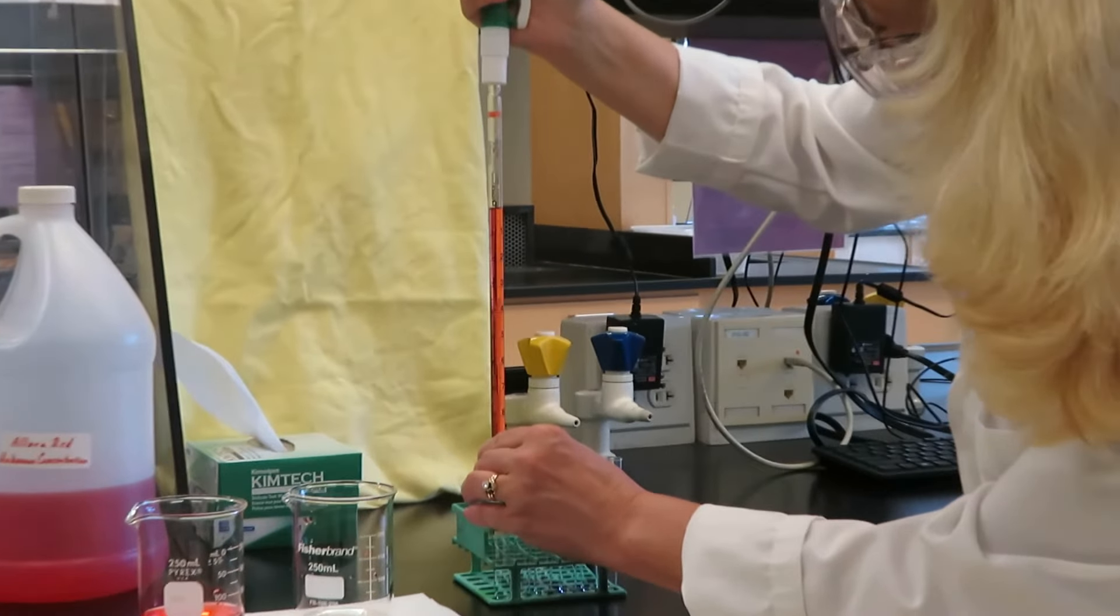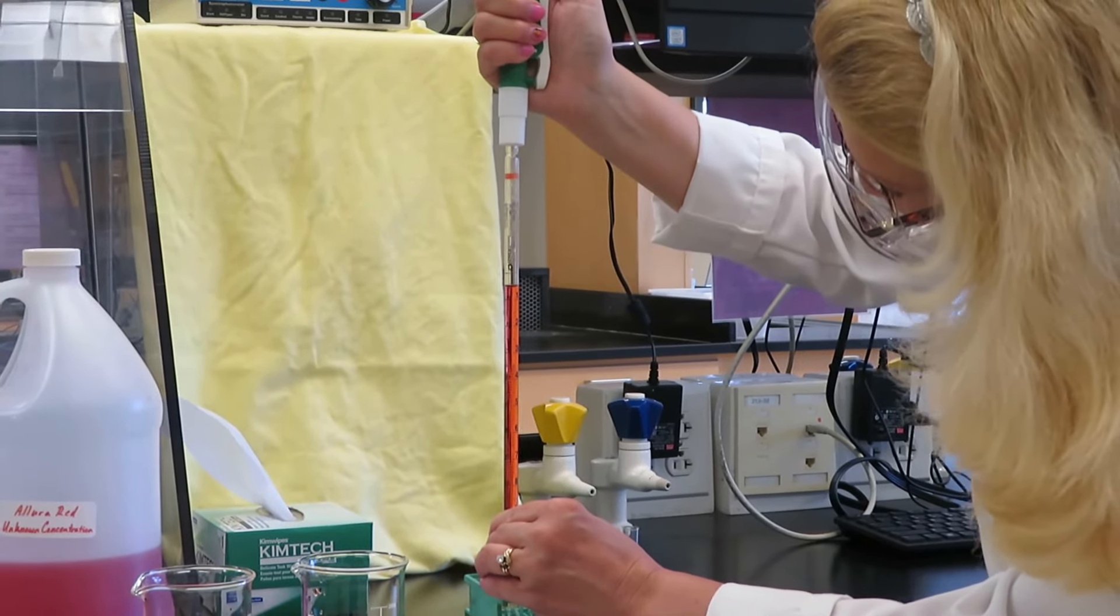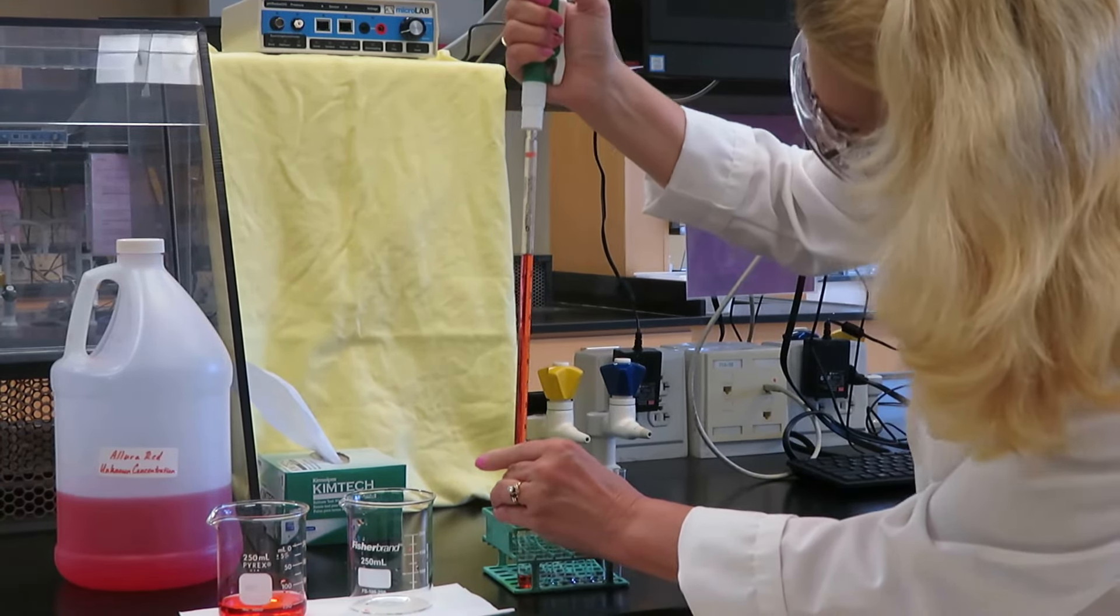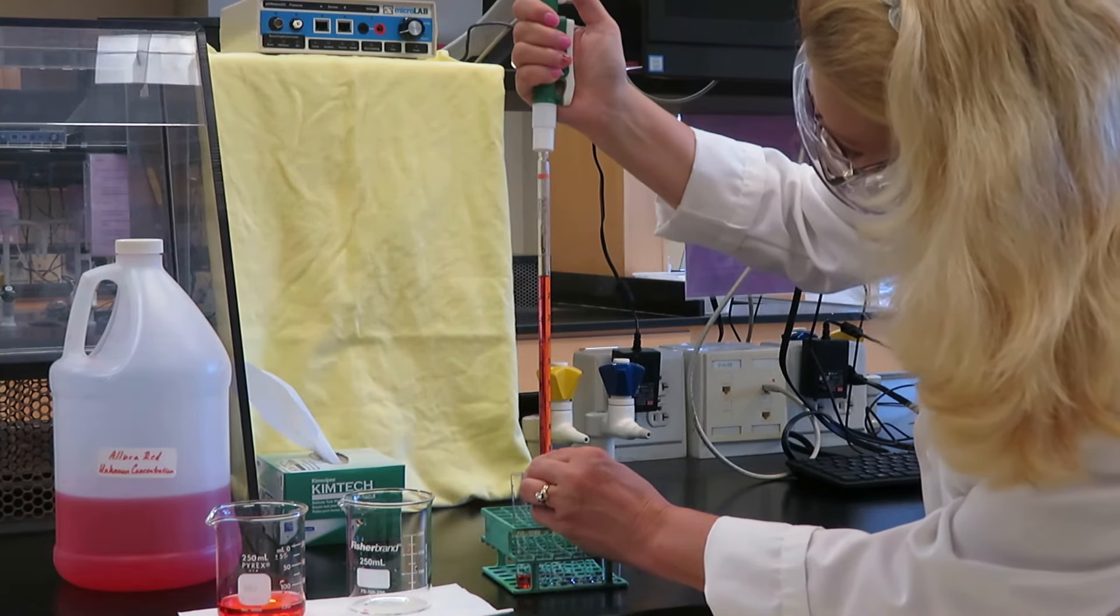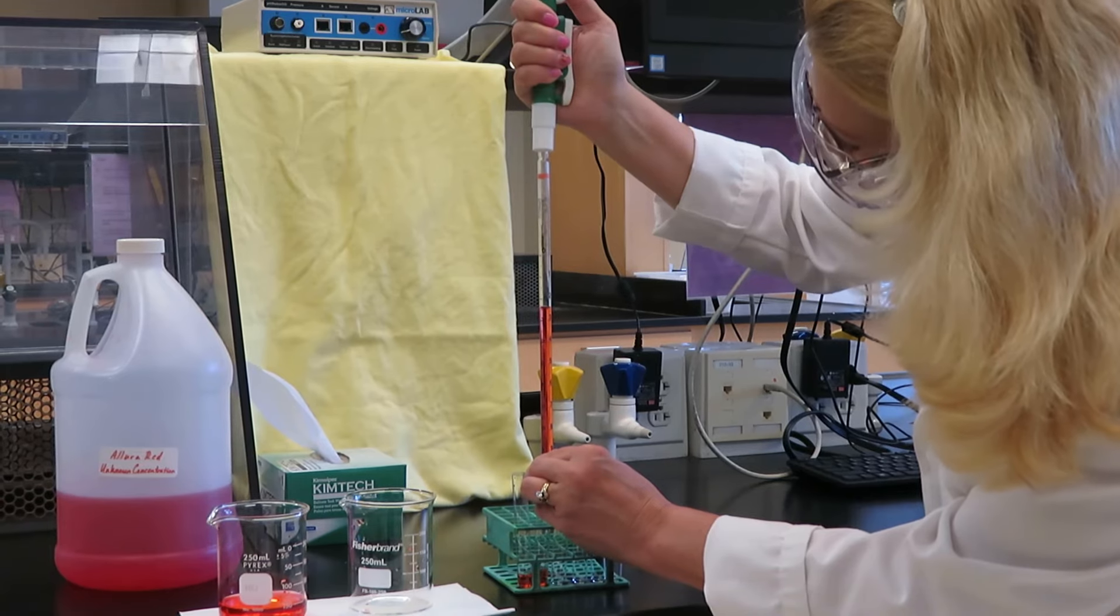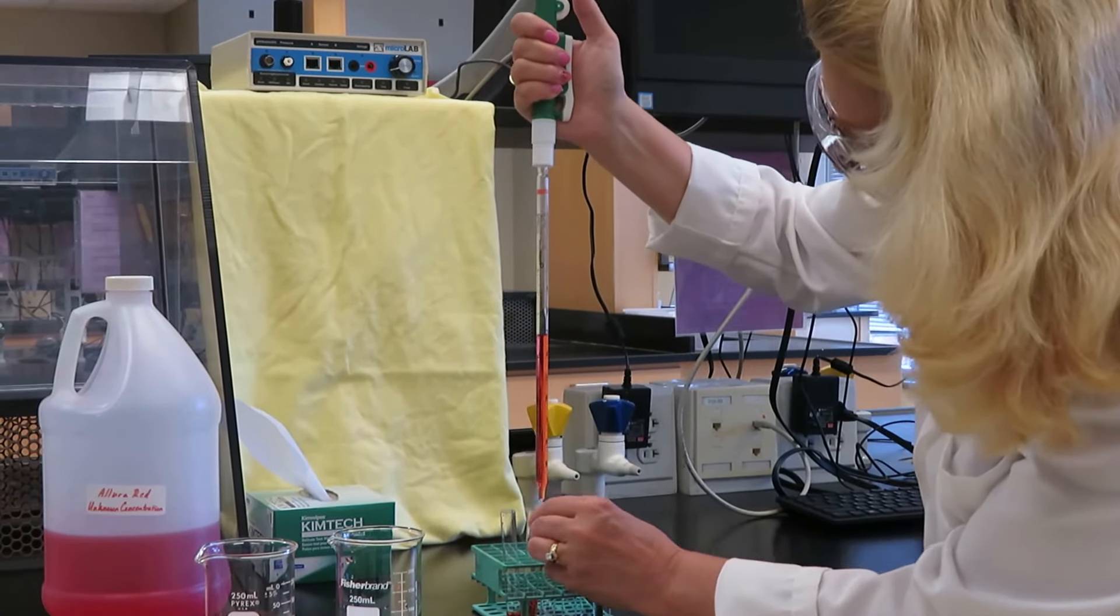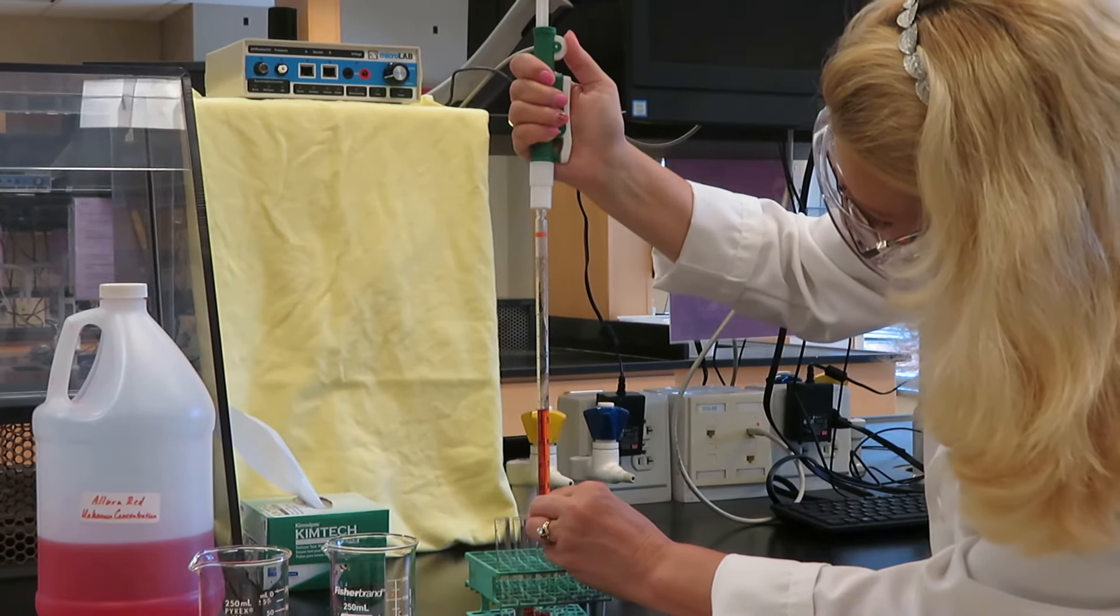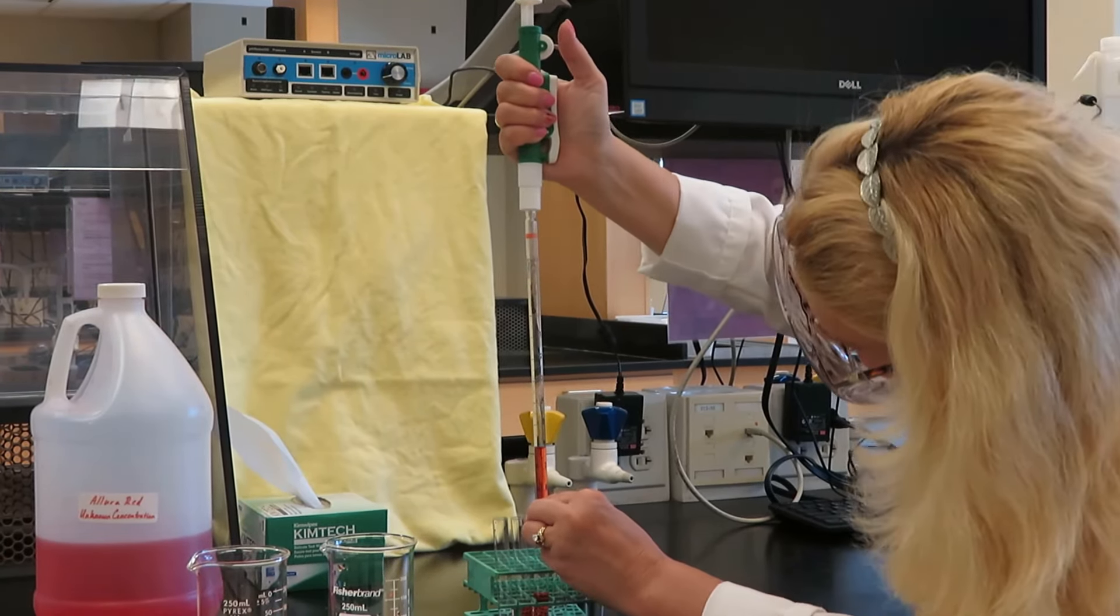And now, if I put it in this test tube, I can now, instead of rolling downward, roll upward, and here is 1 milliliter. I can move to the next test tube, in which I want 2 milliliters. So I will go from 1 to 3, again, rolling upward, and reading at the bottom of the meniscus. And now I can go to my last test tube. I am at 3 milliliters, so I will go from 3 to 6 milliliters.